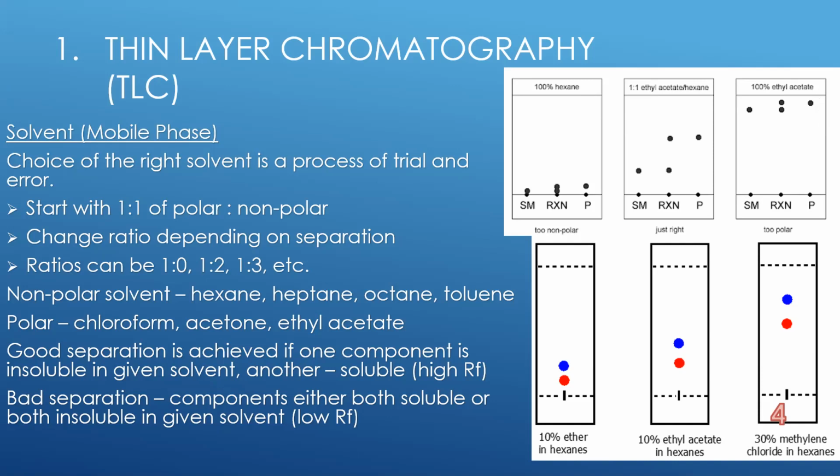And when performing your experiment, you do not want these values to be too high or too low. So it should be somewhere in the middle. The best results are when the dots are separated, they have a high distance between them, and they are situated on much more surface. So this tells us about the best result.